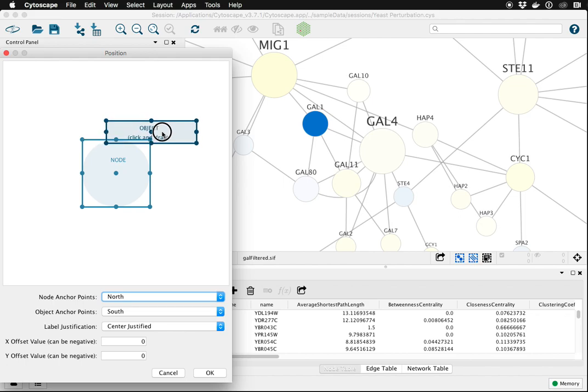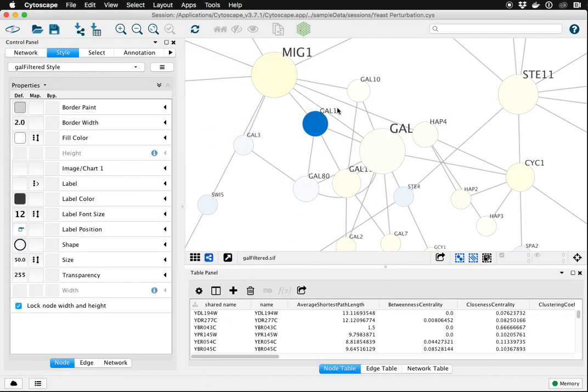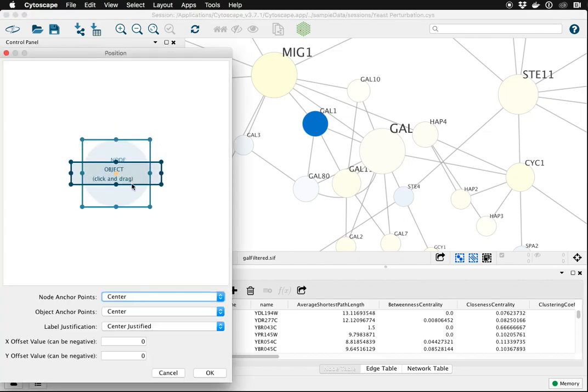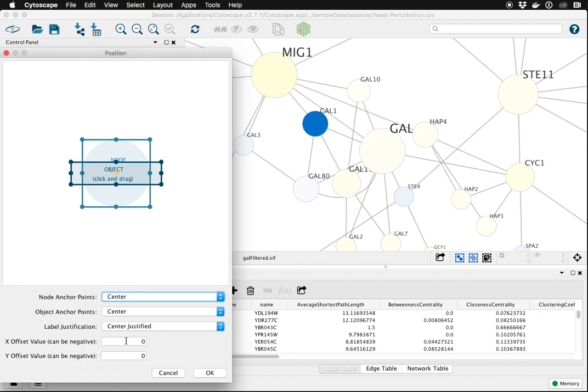Likewise, you can move it to the corner, have it in the upper right corner, or wherever you'd like it. These first two options designate the same relative positions that we just did by dragging and dropping. You can also control the justification of the text within the label space, and you can also in very fine detail specify specific offset values for the x and y coordinates to position the label.